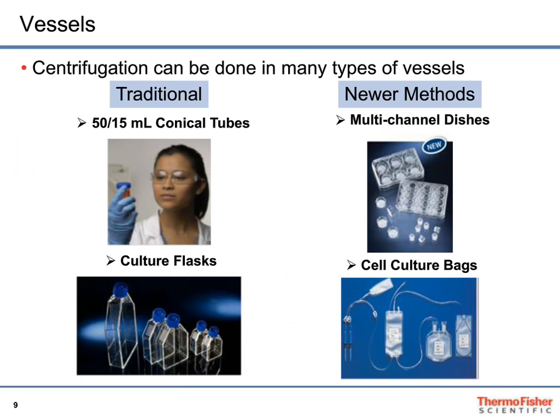But let's start here. Let's talk about the place that we find is most important. I certainly do. Is that the end users first usually encounter us by saying, this is what I want to spin, or this is what I want to do. So we like to talk about our centrifuges because they're the big things that are most obvious, and you look at them and the rotors that go in them. But we need to remind ourselves to start with what's going to be getting spun.